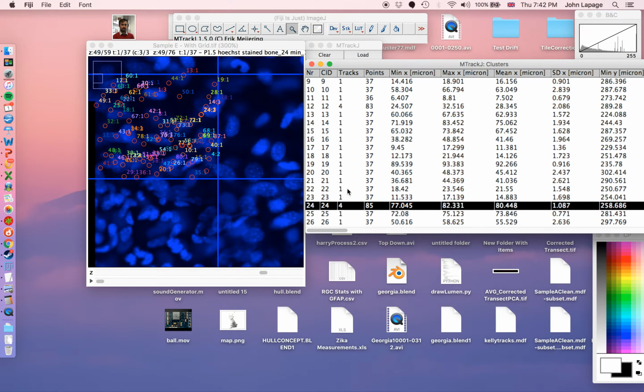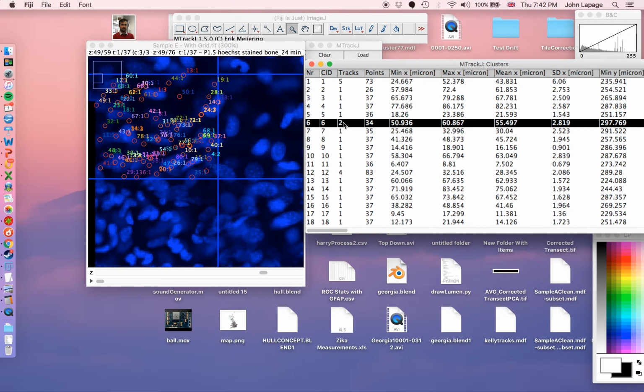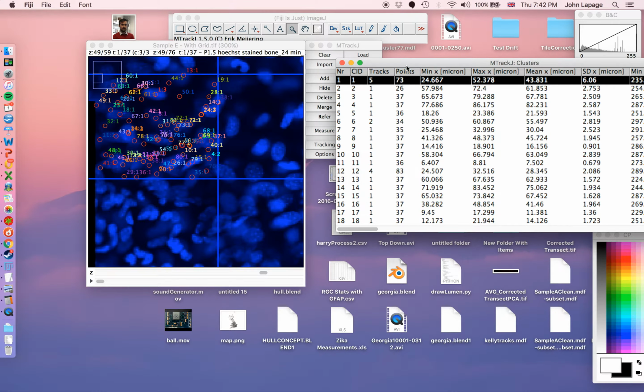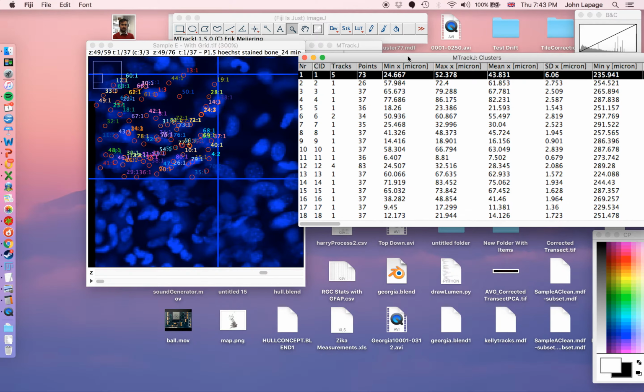This one's a 4, so that one's probably okay. There's a 4, it's probably okay. There's a 2. You know, it's very easy to just accidentally miss one when you're clustering. So we can have a look and see what's going on. I'm going to fix this whole thing and we'll see how it goes. The person already has fixed this, said I could use this, so we'll try.